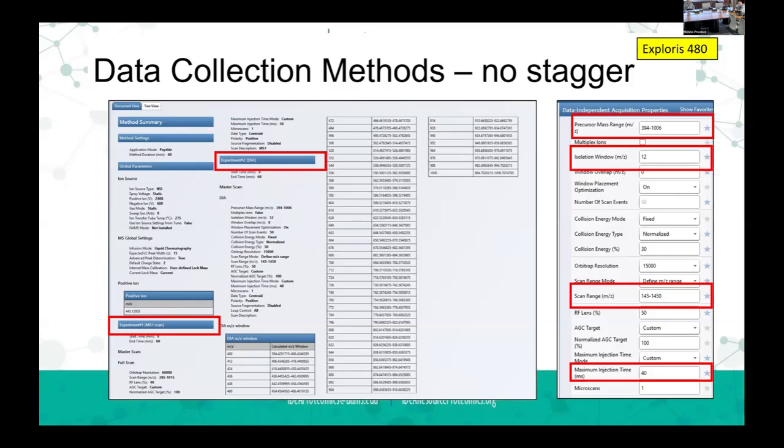And the big ones are, what's your precursor mass range going to be for your DIA experiment, what's your isolation window, what's your scan range. Mike talked about, I think you did like 380 to 9-something. 350 to 950. Yeah, so his is a little shorter, ours is a little wider. We're probably not getting a lot of coverage anyway, these are the things that you can tweak. That's my precursors. Oh, okay, your precursors, yeah, up here, but I think we're still a little bit higher.